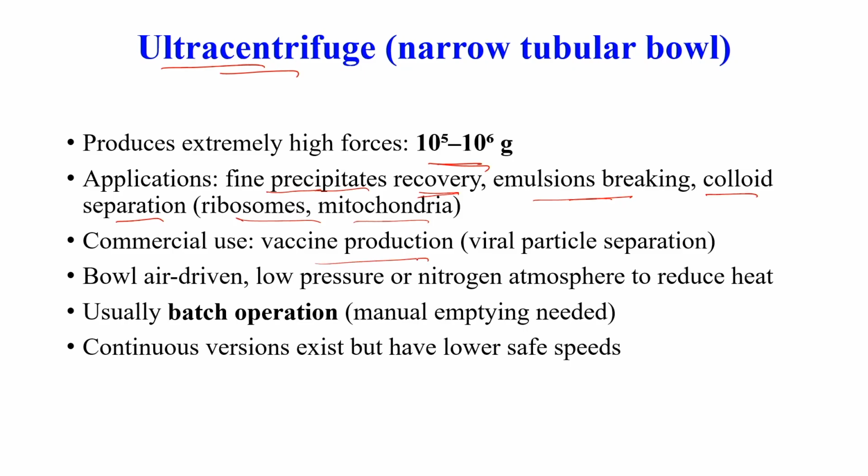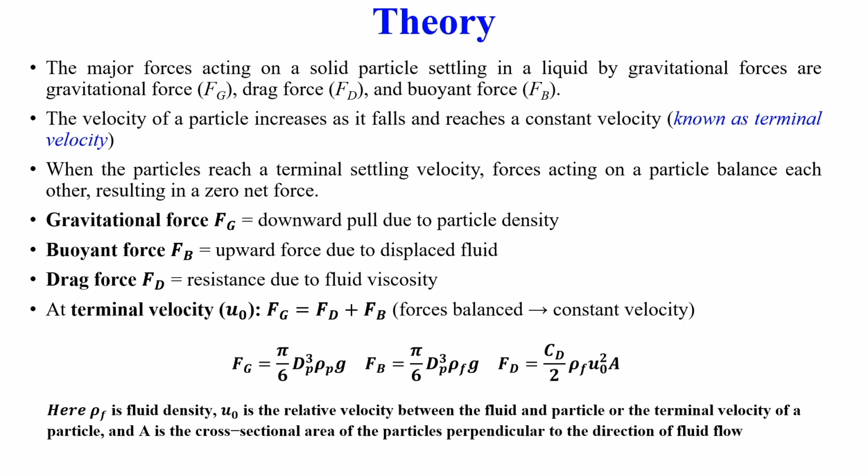Commercial use is, let us say, for vaccine production and viral particle separations. Usually it operates in a batch mode. Now, what is the theory of centrifugation? First, let us consider solid particles settling in a liquid by gravitational force. So, you have solid particles settling in a liquid.